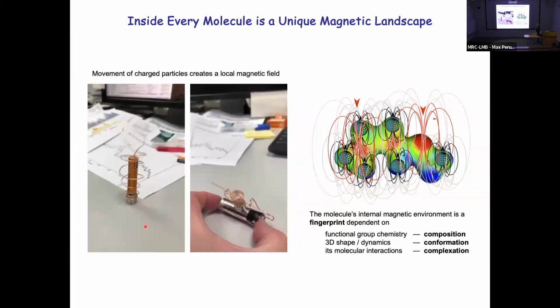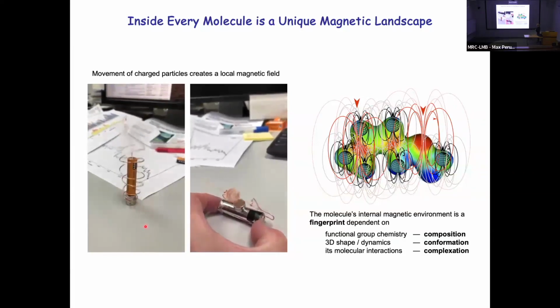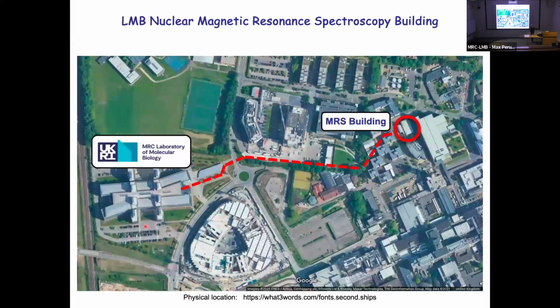So this is the reason we have NMR, because it gives us unique insights into the behavior of molecules, and we can extend it to molecules inside whole cells and the macromolecules, proteins, nucleic acids, whatever, that we find in projects controlling biological pathways. And so we can look in a mechanistic way at how biological pathways are controlled from a mechanistic and structural perspective. NMR gives you unique insights into the behavior of molecules that you can't get from other biophysical techniques.